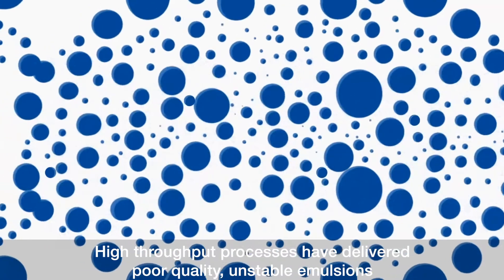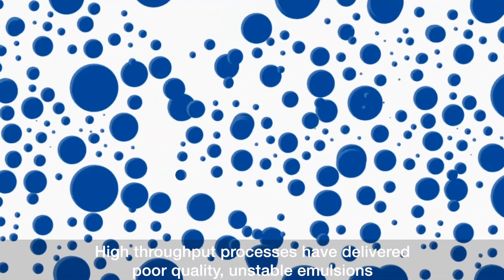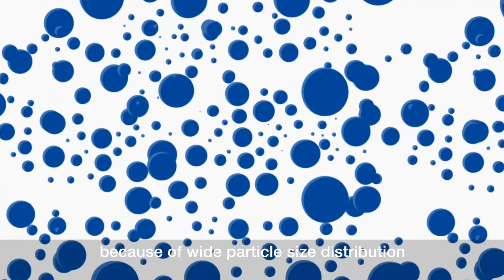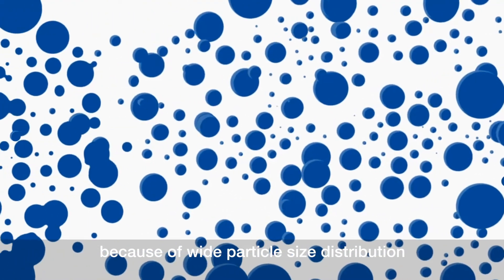Cruder high throughput manufacturing processes typically deliver poor quality unstable emulsions because of the wide particle size distribution they produce.